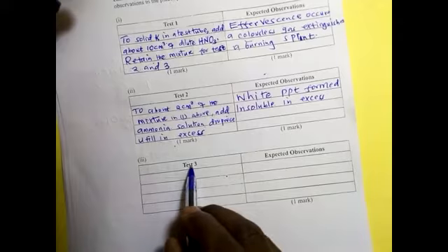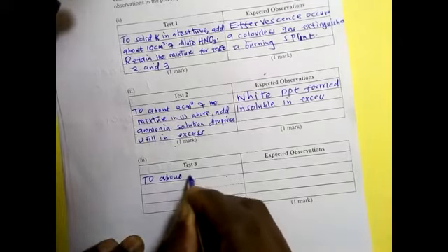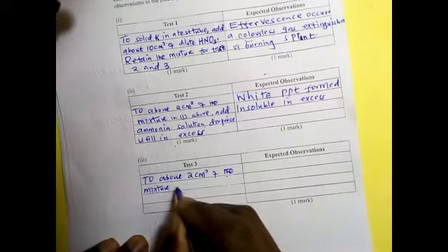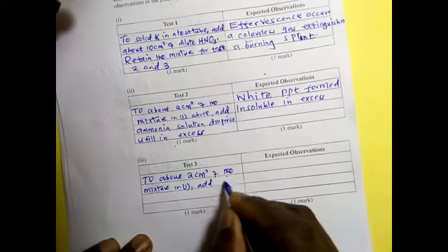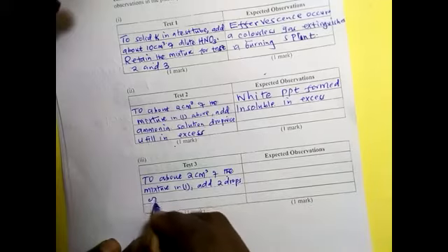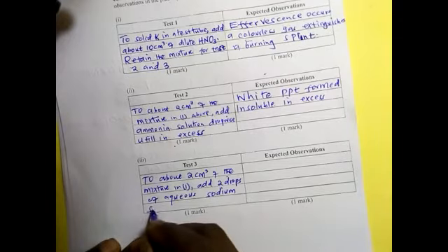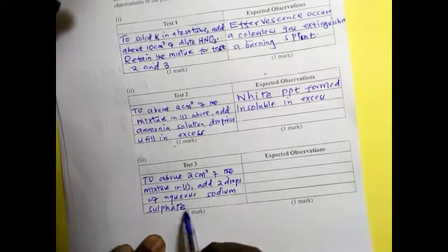Let us go to test 3. To about 2 centimeters cube of the mixture in Roman 1, add 2 drops of aqueous sodium sulfate.